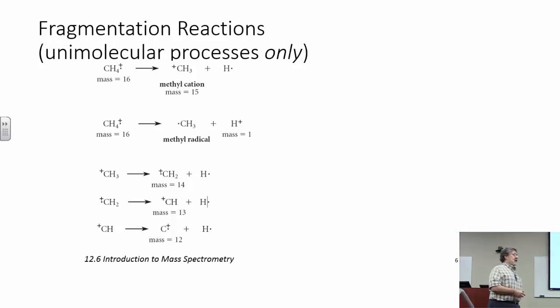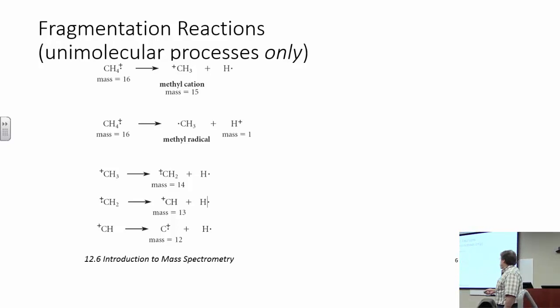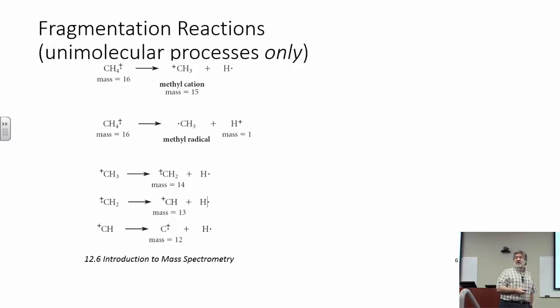And you have to think about it a little bit. Now, one thing that should be clear to you by this first example is it's all carbocation chemistry. There's nothing new here in terms of chemistry. Remember stability of carbocations from last semester? That applies to this. It's what lets you know which process is more likely to happen.